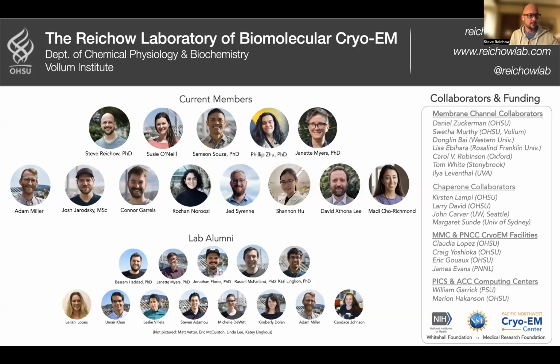Sure. I won't say that some of them didn't work, but some of them didn't work as efficiently. I think MSP 1E1 is the variant that we ended up having the most success with. At least with these MSPs, they vary in the diameters of the discs that they make, right? And so presumably some of the smaller ones didn't work because they just weren't big enough for the channel.